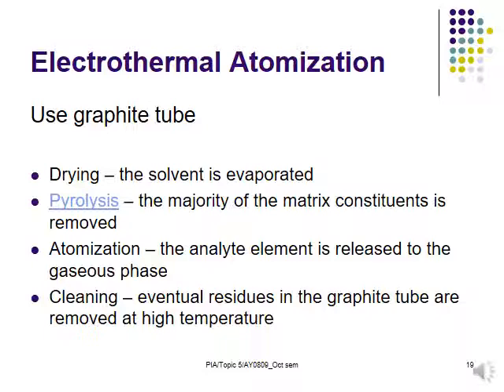So when we talk about carbon, we can say that the graphite tube is a very stable compartment, so that it can be the electrothermal source.